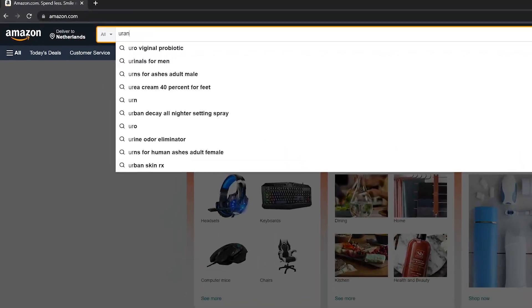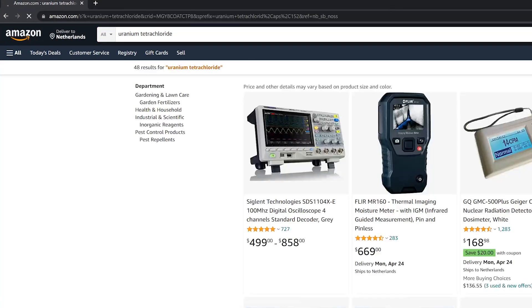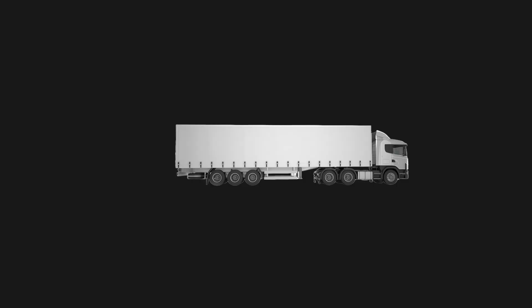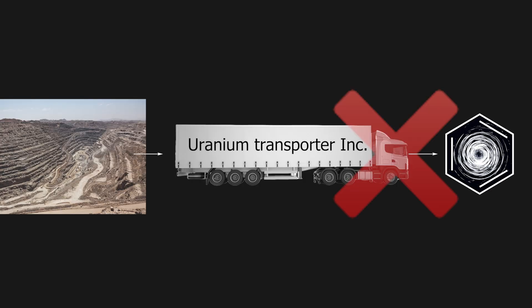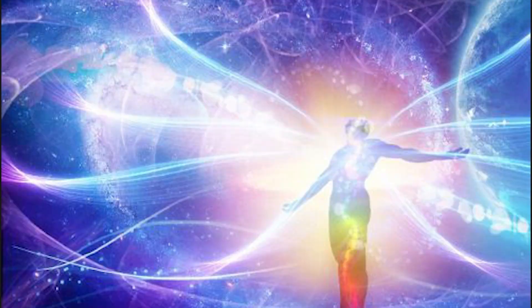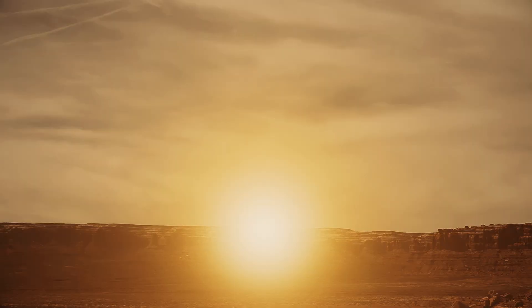But to make that I need uranium tetrachloride, and I can't seem to buy that anywhere. Isn't that so weird? But as a chemist I am not held back by this very odd supply issue of uranium compounds, as I can shape any molecule to my will. So I can just turn a rock into uranium tetrachloride.